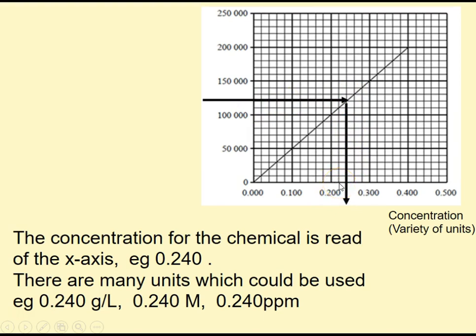Need to be able to read the graph. Some of you are not so great with reading graphs, so there's 1, 2, 3, 4, 5 divisions, and this is 0.1, so 5 into 0.1 will be 0.02. So 0.02, 0.04, 0.06, 0.08, and 0.1.